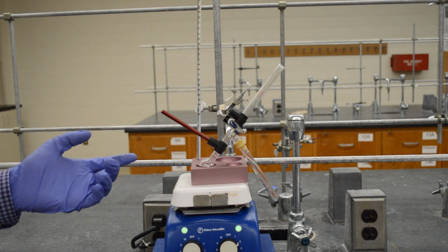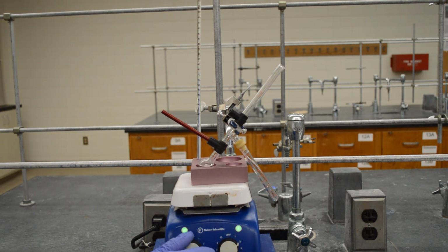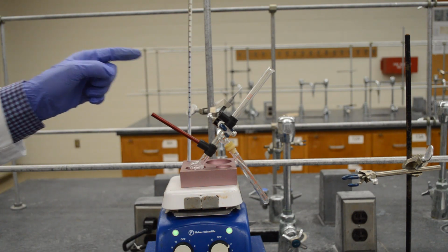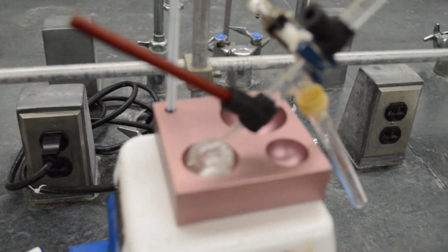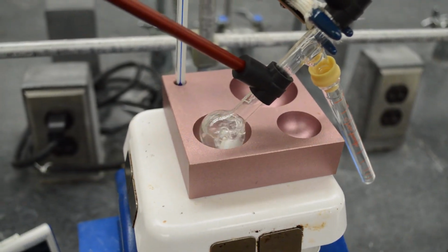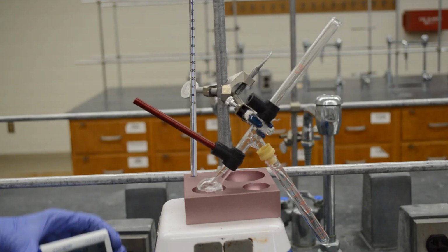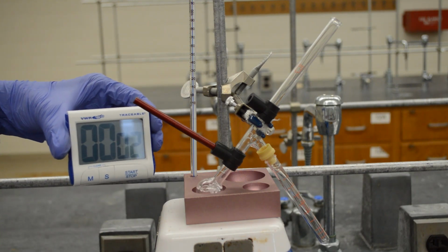1-pentanol and acetic acid both boil above 100 C. So I'm going to raise the temperature and let's wait for the boiling. Okay, it started boiling at about 120 C. You can see that it's boiling right there, and the temperature is a little below 130. I'm going to start the timer. Let it go for 45 minutes.